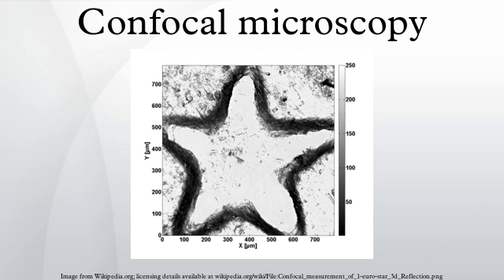Microlens enhanced or dual spinning disc confocal microscopes work under the same principles as spinning disc confocal microscopes, except a second spinning disc containing microlenses is placed before the spinning disc containing the pinholes. Every pinhole has an associated microlens. The microlenses act to capture a broad band of light and focus it into each pinhole, significantly increasing the amount of light directed into each pinhole and reducing the amount of light blocked by the spinning disc. Microlens enhanced confocal microscopes are therefore significantly more sensitive than standard spinning disc systems. Yokogawa Electric invented this technology in 1992.